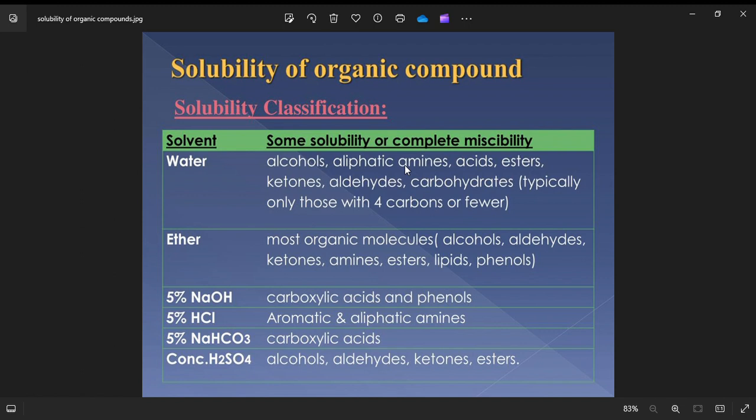Now, when the solution is formed and is homogeneous, it's difficult for you to identify. So the only way you can identify is by carrying out specified solubility tests of such compounds. Solubility tests are very important because they allow you to make a choice of which functional group is present or is available for whatever you want to do. You can test them in water.